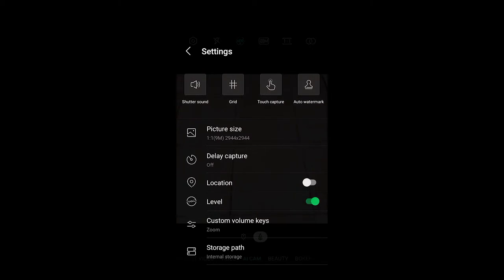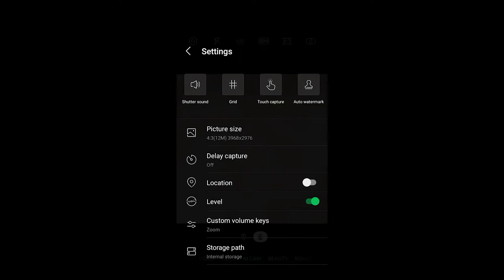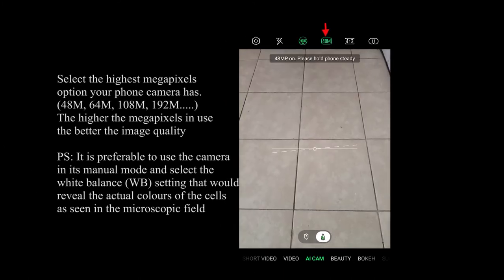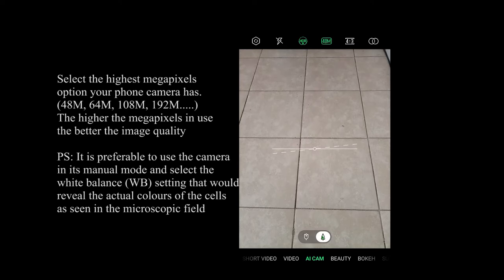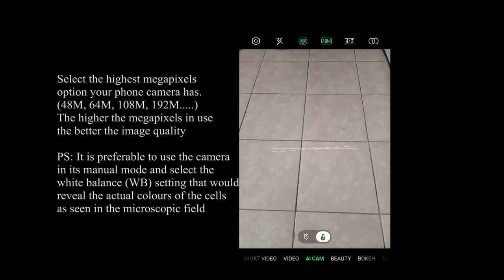For a start, you just might want to consider improving on the image quality of your phone camera. We'll probably need to get into the settings of the camera and work with picture size. You might want to consider working with the best resolution your phone can offer. In this context, it's the 3968 by 2976 for my phone — that's aimed at improving the picture size and quality. My phone happens to have a 48 megapixel setting and I'm going to arm that up. All of this is meant to retain quality even after zooming in the course of taking the picture under the microscope.